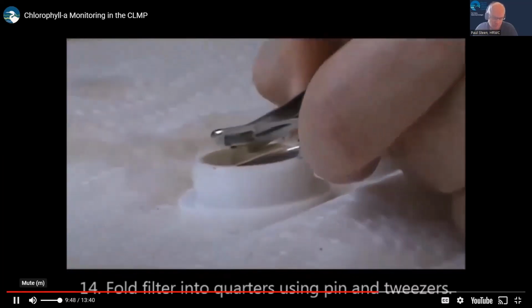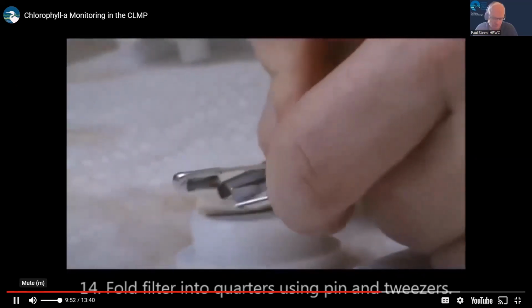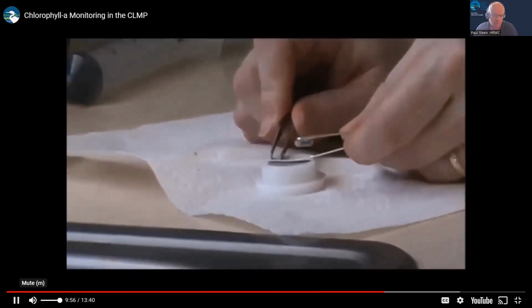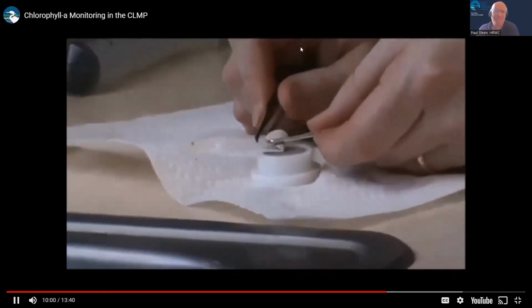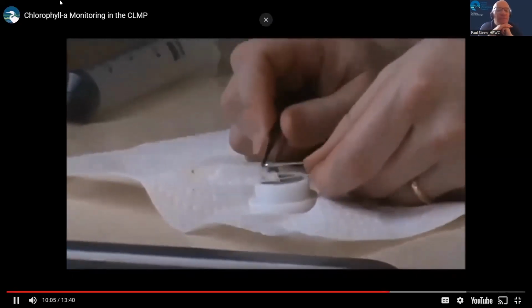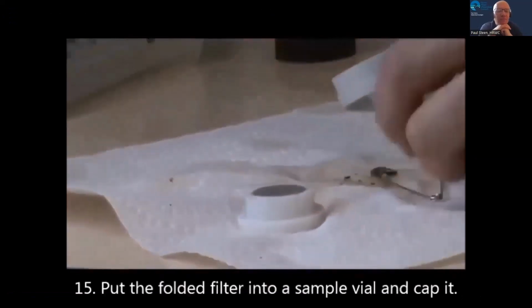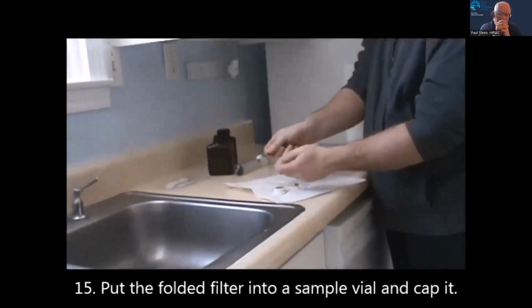Remember, never touch the filter with your fingers. Put the folded filter into a sample vial and cap it.